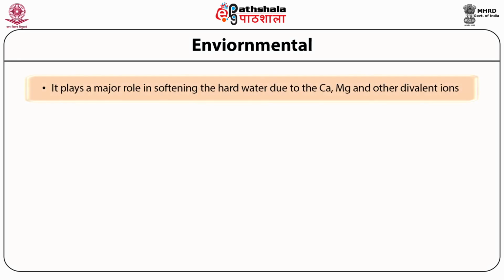Applications. Environmental. It plays a major role in softening hard water caused by calcium, magnesium, and other divalent ions. The water is passed through a cation exchanger charged with sodium ions. Calcium and magnesium ions are retained in the column while sodium is exchanged.